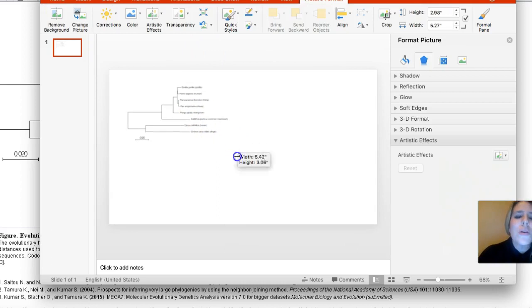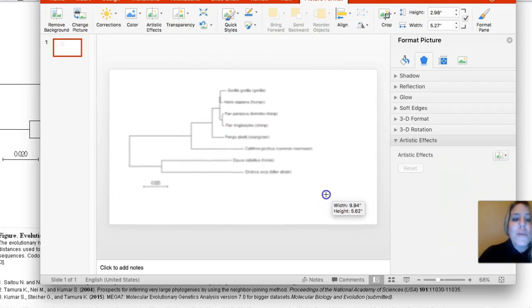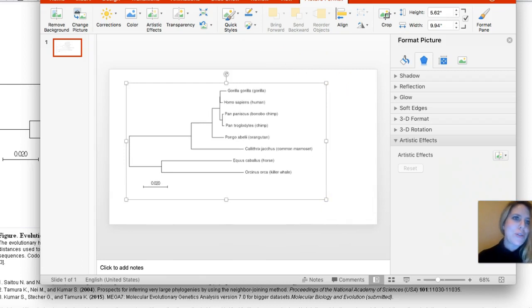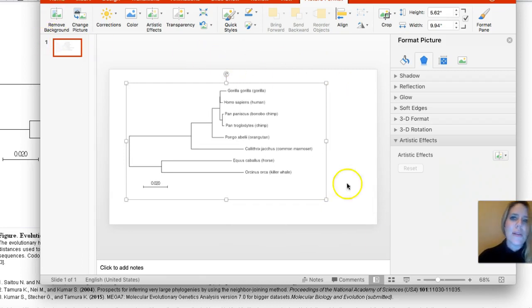Click off, and now it's the right size. If you click it and go to the corner, you can make it big. You want to leave some room on the side because we're going to be adding pictures here.